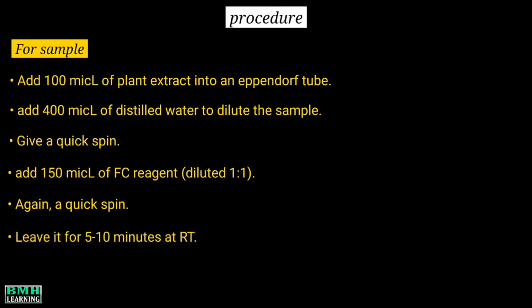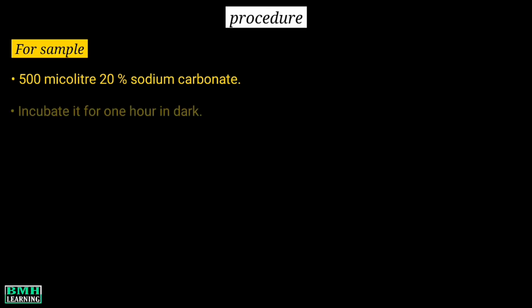Leave it for 5 to 10 minutes at room temperature. Bluish color compound is formed. Add 500 microliter 20% sodium carbonate. Incubate it for 1 hour in dark. Take the absorbance.